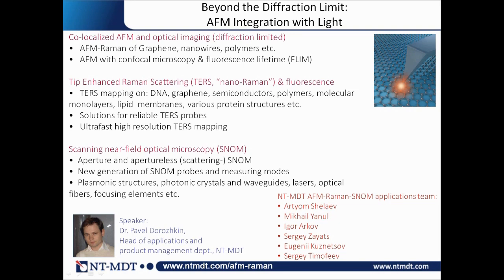You have already seen the plan of the talk. I will start with co-localized AFM and classical diffraction-limited optical techniques such as confocal Raman, fluorescence microscopy, and lifetime imaging. And then I will move on to the optical techniques beyond the diffraction limit, such as tip-enhanced Raman scattering and tip-enhanced fluorescence. And I will finalize the talk with what is new in NT-MDT technology in scanning near-field optical microscopy.